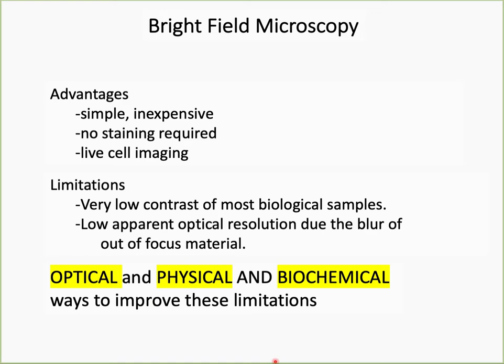But there are some disadvantages or limitations. There is low contrast. Most of the biological specimens are composed primarily of water, and as discussed previously, water makes for a low contrast of the specimen, and it is limited to the resolution of 0.2 microns.